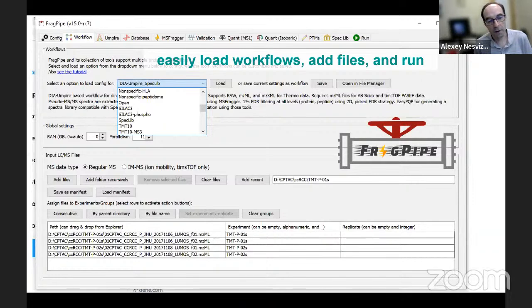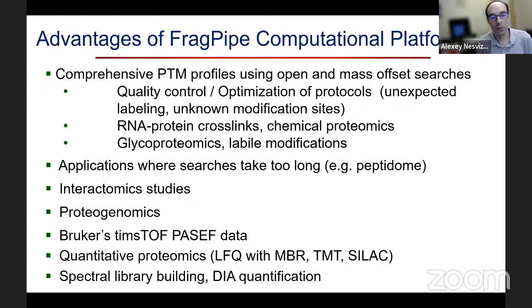That's very nice. And we have other ways of running this pipeline as well, including what we call the Philosopher pipeline. So you can run it on the cloud, you can run it on desktop, on Linux, HPC. That's why it's a very powerful system, because it's platform independent, Windows and Linux, and it's scalable to very large amounts of data.